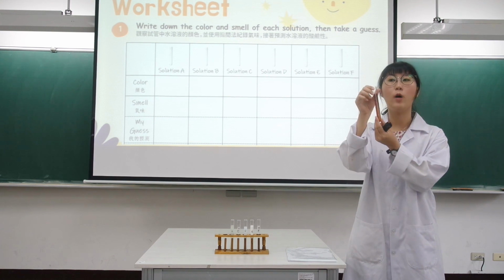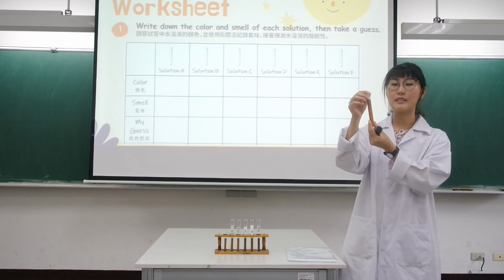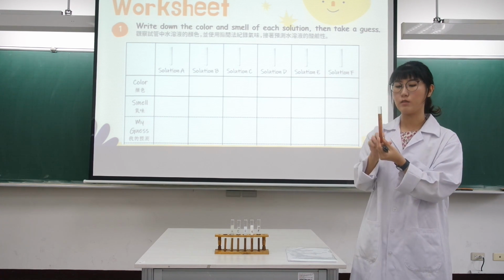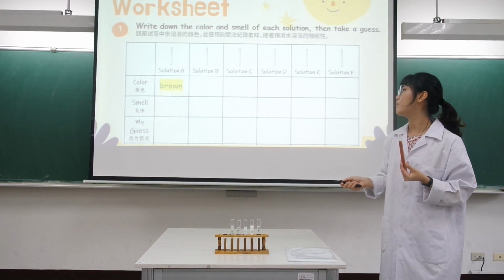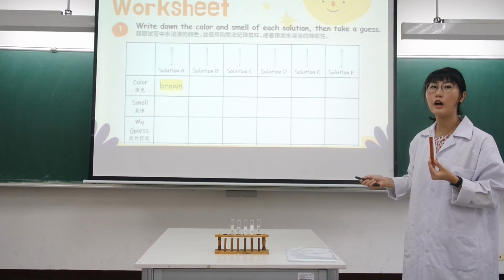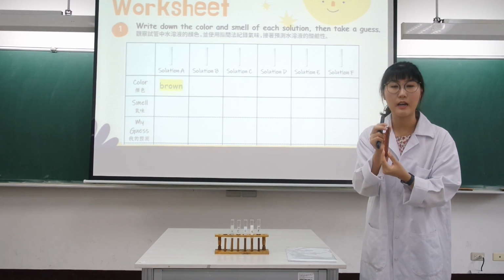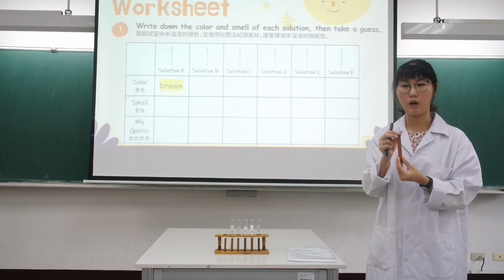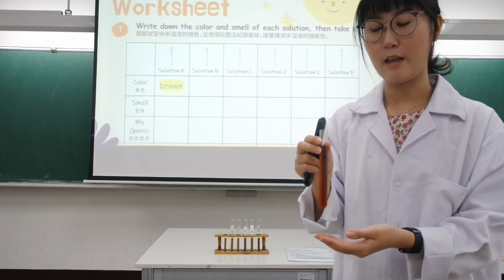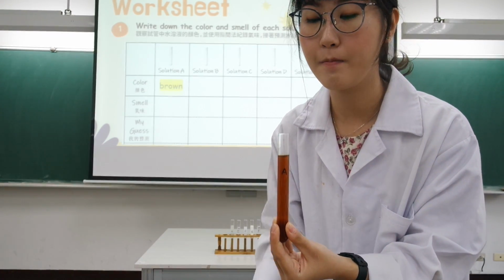Can you tell me what color is it? Very good. Everybody says it's brown. Good job. So it's brown, and I want you to write down brown here. The color of solution A. Very good. And next, I want you to tell me how does it smell. So, Ben, can you tell me how does solution A smell?